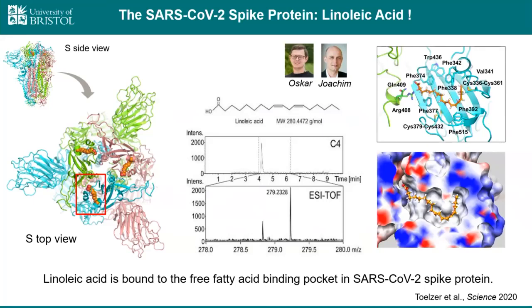When we published our first paper about the pocket, we found that OC43 has this locked structure according to the PDB file. And we said, well, it probably will not bind linoleic acid because it's somehow locked. And then David Veesler, who published this structure, contacted us and said, well, we used beta-octylglucoside to prepare the grids, and then we saw some density there, and we thought it's the detergent, and we really didn't know what to do with this. But actually, there's density in the pocket. And here it is. This is his EM map.